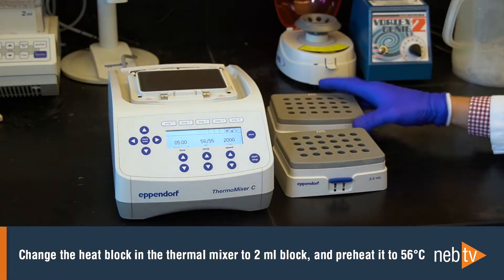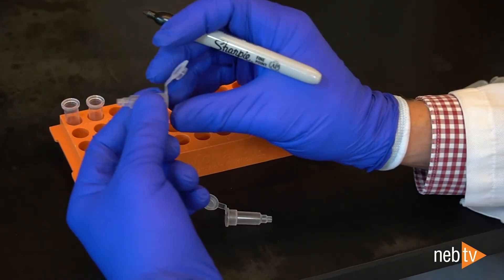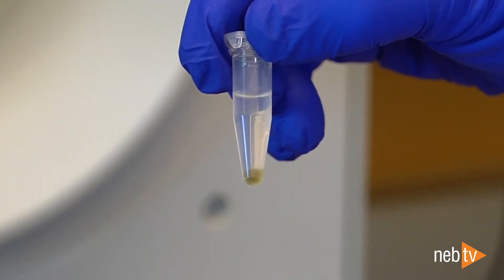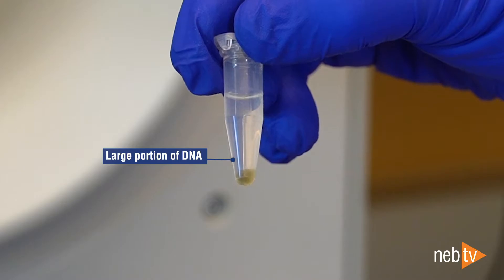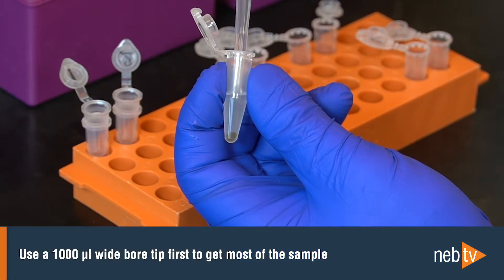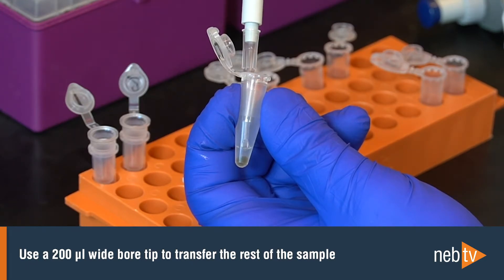In the meantime, change the heat block in the thermal mixer to a 2 mL block and preheat it to 56 degrees Celsius. It's also helpful to prepare and label all the plastics that you'll need for part 2 during this centrifugation. The top layer contains the DNA, but a substantial amount of the DNA will be located close to the interface between the clear upper phase and the lower protein phase. Therefore, it's important to transfer as much of the upper phase as possible. Use a 1000 µL wide-bore tip first to get most of the sample and transfer it to a new Monarch 2 mL tube. Then use a 200 µL wide-bore tip to transfer the rest of the sample.